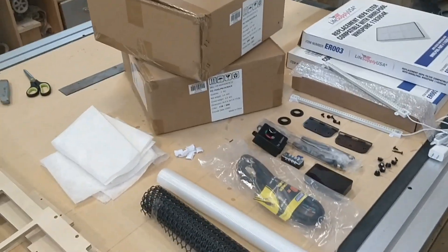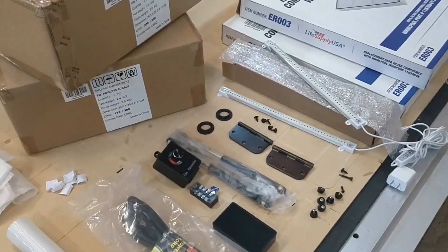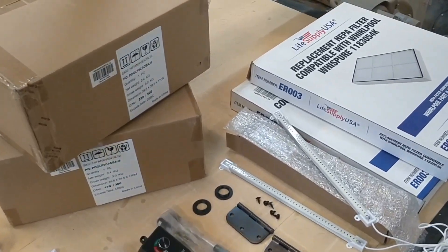Before the assembly, I just want to go over the component list real quick. This will be what comes with the kit, or if you're just building your own, it'll give you an idea as to what you're going to need, or may or may not need.